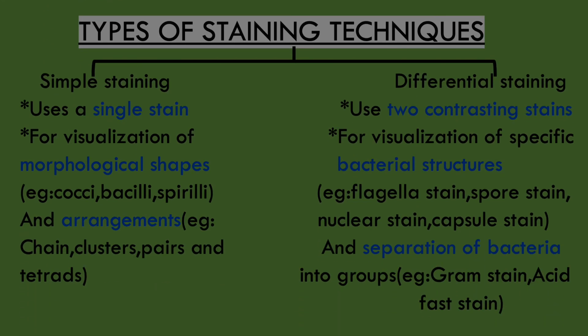Now we can discuss types of staining techniques. Staining techniques can be classified mainly into two: simple staining and differential staining. Simple staining is when we use a single stain only for the visualization of microorganisms, whereas differential staining is when we use two contrasting stains for the visualization.